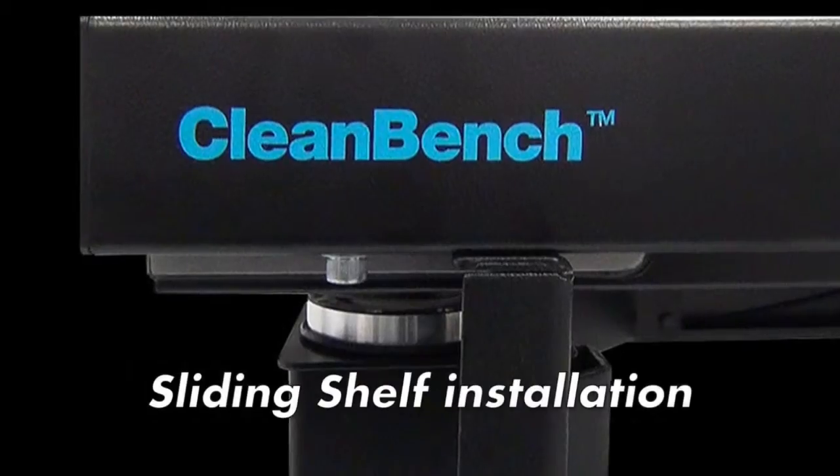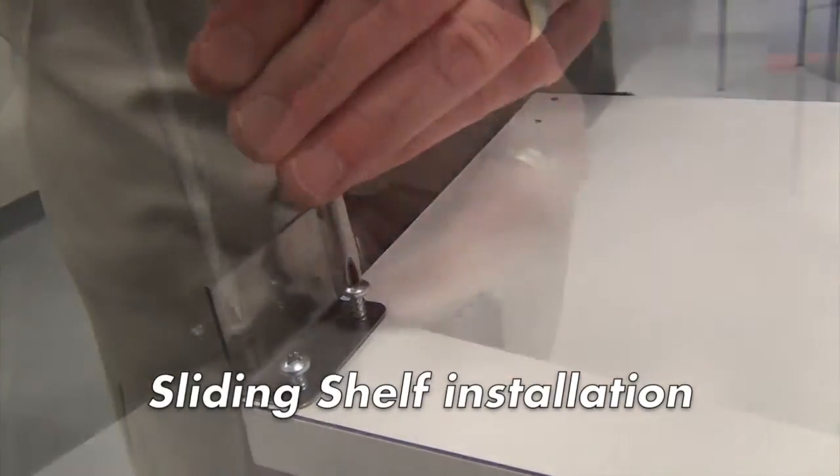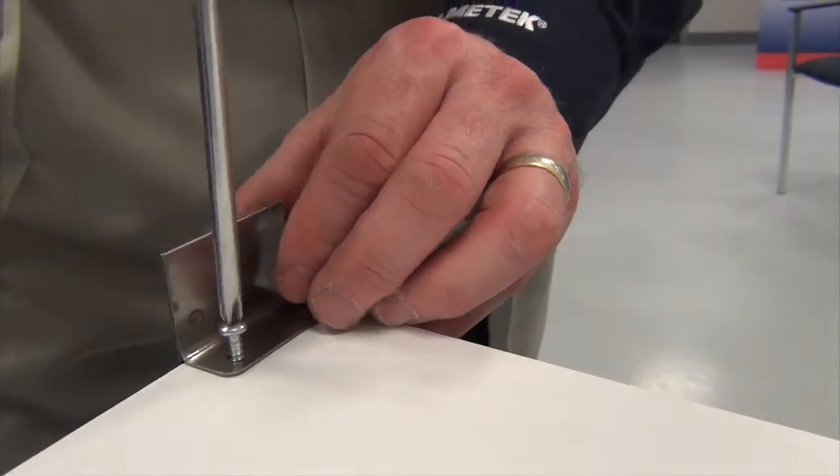With the rear support bar in place, the sliding shelf can be installed. Unpack the shelf. Locate the hardware bag with two clips and four screws.